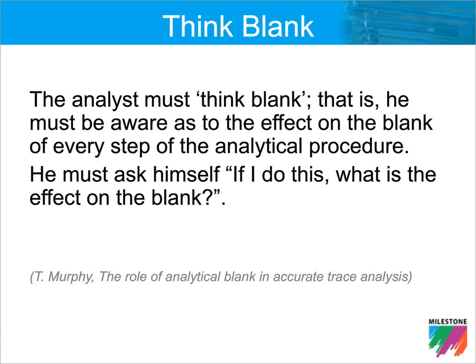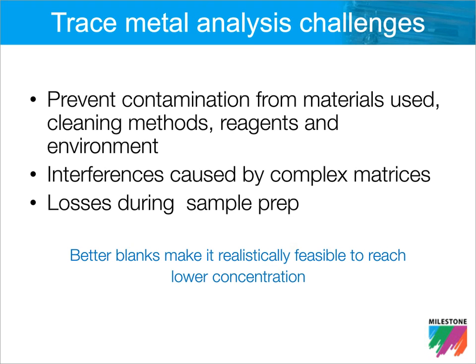Now, there are a number of challenges in trace metals analysis, but here are three big ones that all of us face. One, of course, is that we need to prevent contamination during any step of the trace metal analysis process. Certainly, we want to eliminate any potential interferences on the analytical instrumentation caused by difficult matrices. And also, we want to minimize or actually eliminate any potential losses during the sample prep process, whether that be physical loss of sample or possibly loss of volatile elements such as arsenic and mercury during the digestion step.